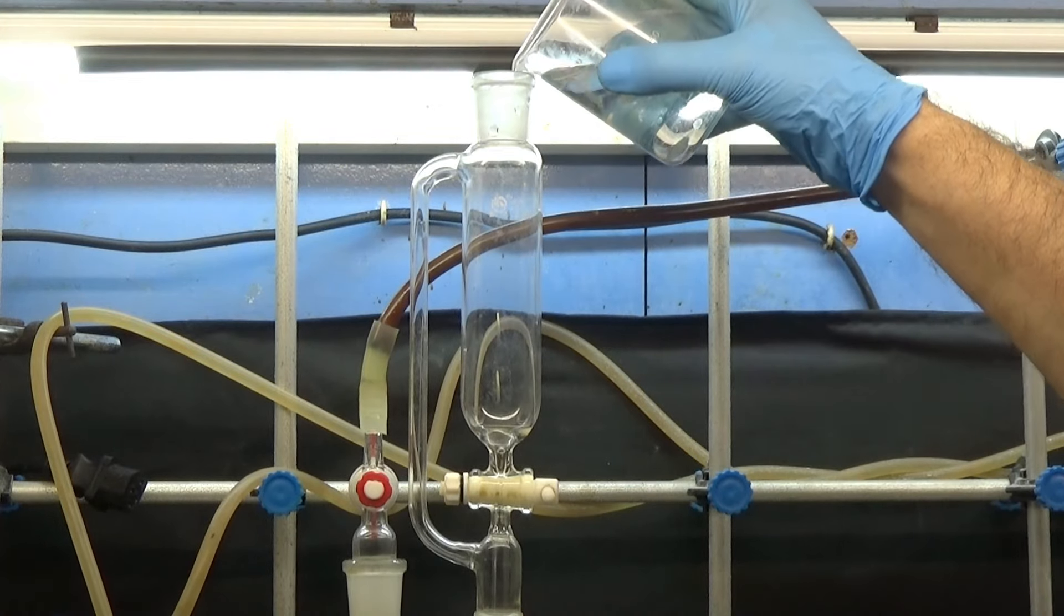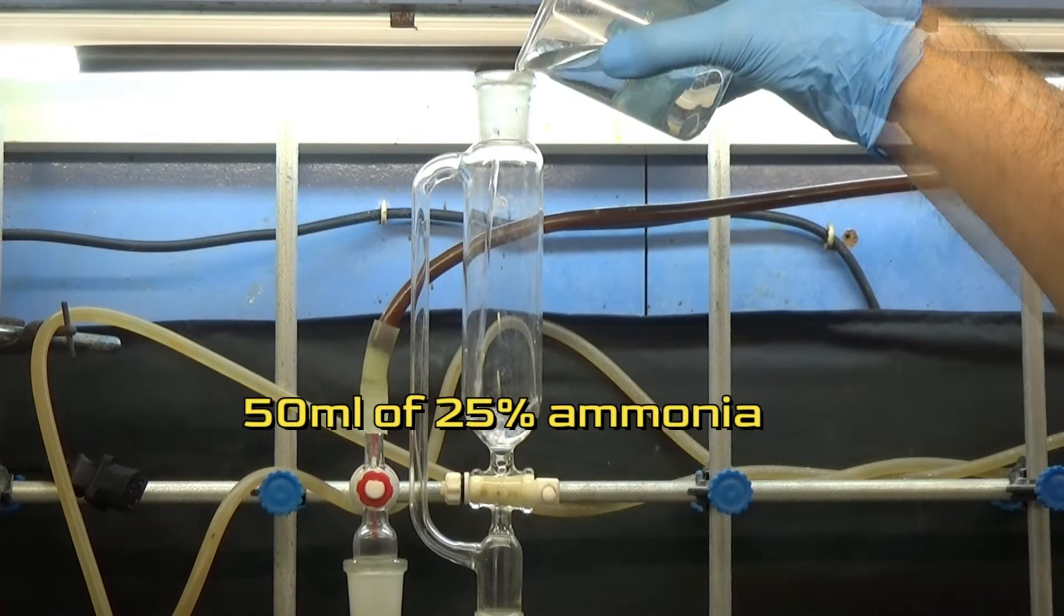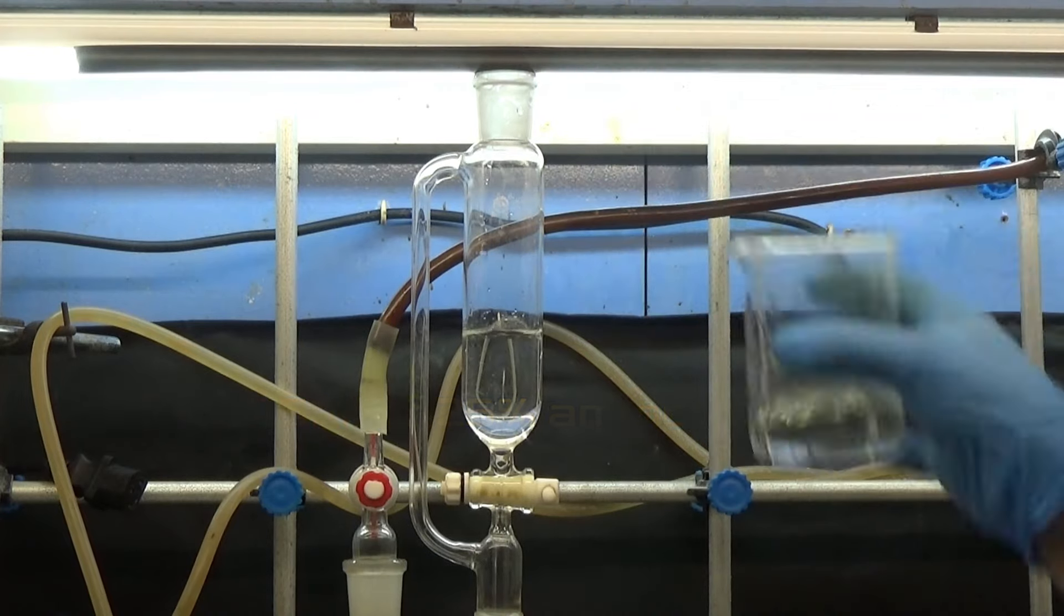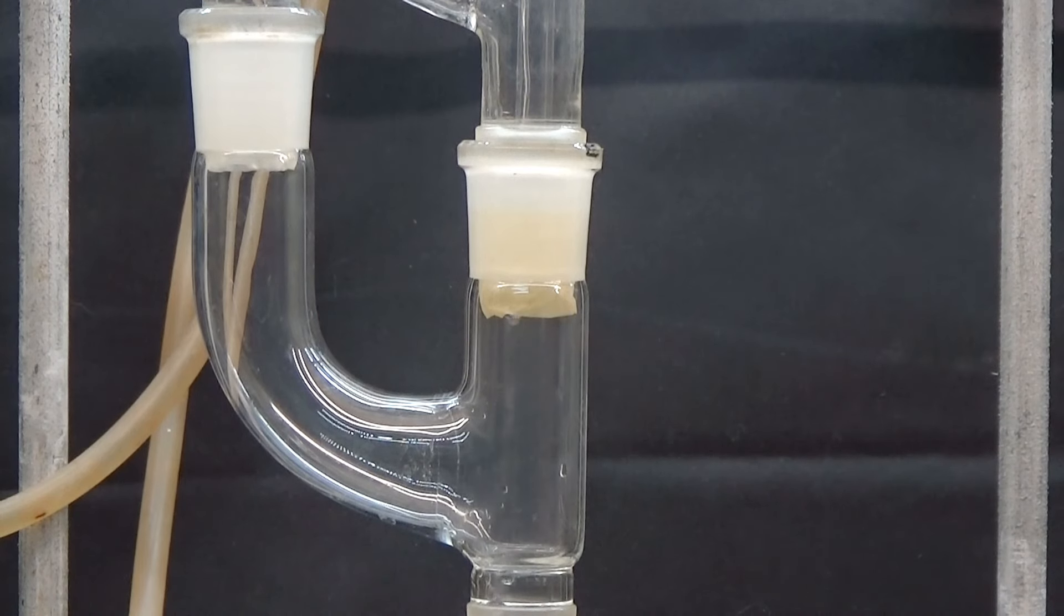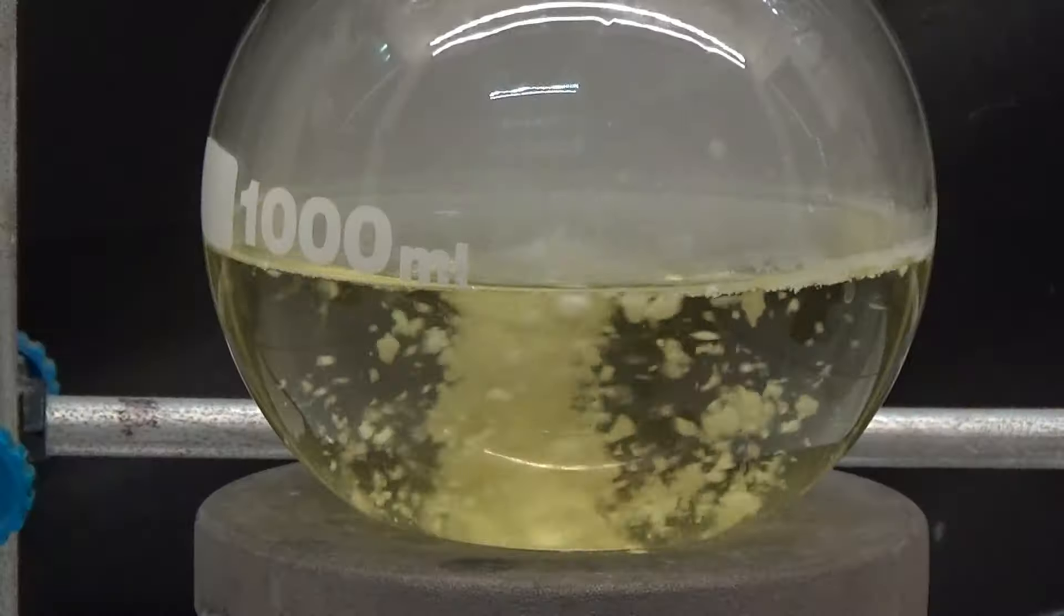Put 50 milliliters of 25% ammonia in the addition funnel. Add the ammonia slowly to the solution obtained to precipitate the phenylglycine.